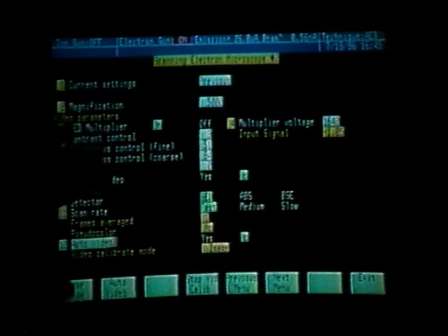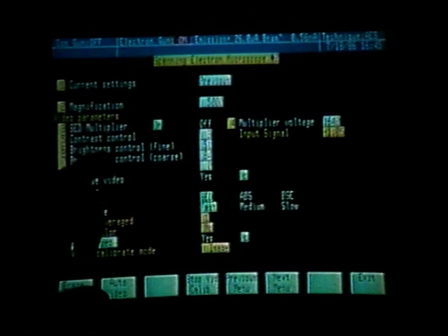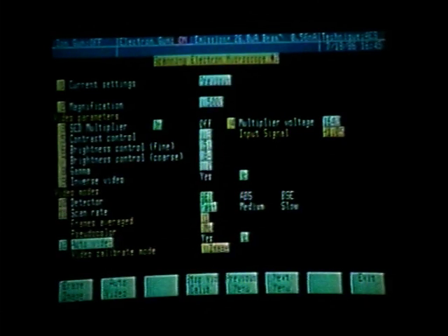What we can do is, as we monitor the TV image in the video calibrate mode and change the brightness and contrast, we can see how we can affect the image which we get for a photograph. Again, notice we have a little bit of green and some red. By changing the contrast using function key number 5, I can slew the contrast up. Now we have a lot of brights and no blacks in that particular image. I can then slew the contrast back and go down. Now we have a lot of blacks and no whites.